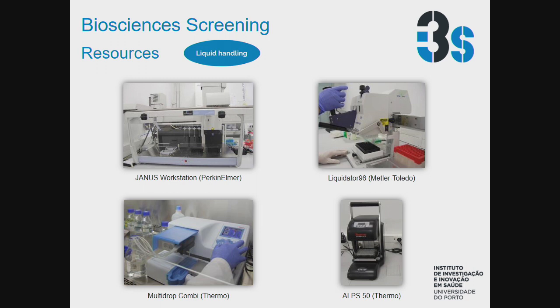We have an automated bulk dispenser, this multi-drop, which is a very precise and accurate machine for whenever you need fast liquid dispensing. You can use this for seeding cells, for instance, on a 96 well plate, it will take you less than 5 seconds to have the whole wells filled with your cells, but you can also use it for performing washes, buffer exchanges, everything that needs rapid liquid dispensing.